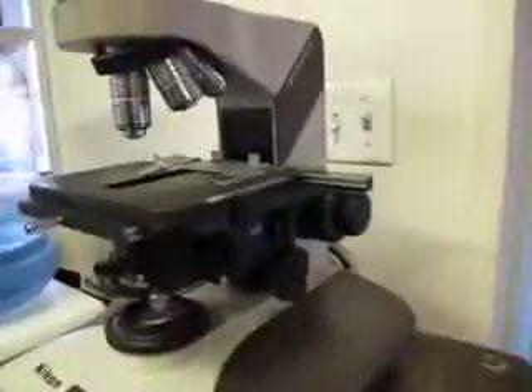You're bidding on a Nikon OptiHot 2 microscope. This came out of a government testing lab. It was sold to us as functioning. The light source is not with it. We did shine a flashlight through it and got light come up through the lens here.